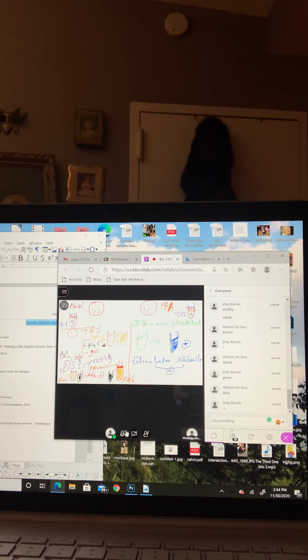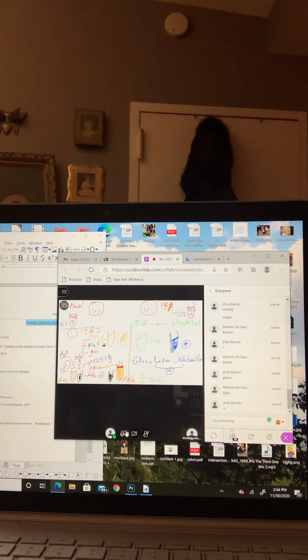And for E. coli, it's citrate negative. So the citrate test can differentiate between many types of the Enterobacteriaceae. Enterobacter and Klebsiella are citrate positive, and E. coli is negative. Okay. Any question about these first three biochemical tests, please?